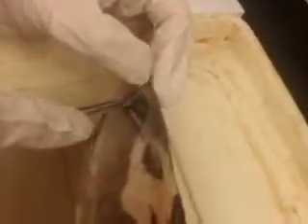The next is the preorbitalis, which we didn't remove, but it is below the eye right here. It originates in the ventral chondrocranium.